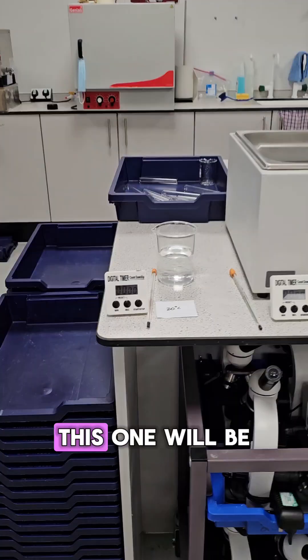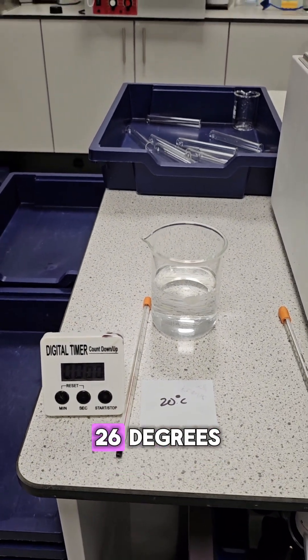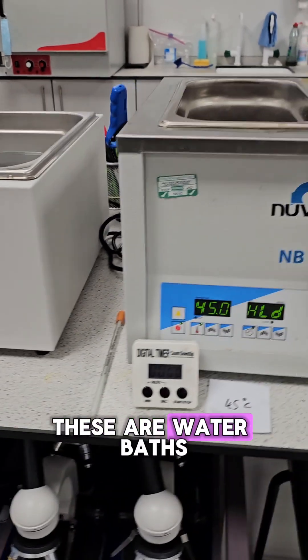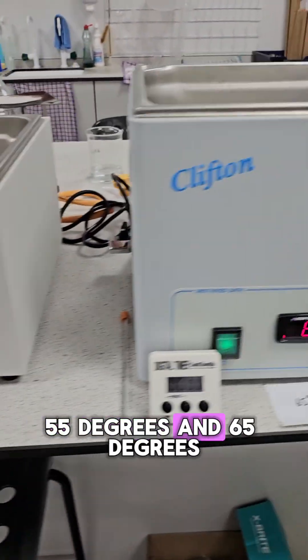I've got these all set up ready. This one will be room temperature, so I'm going to put some ice in there because the room temperature in here is about 26 degrees. And then there's one at 35 degrees — these are water baths — 45 degrees, 55 degrees, and 65 degrees.